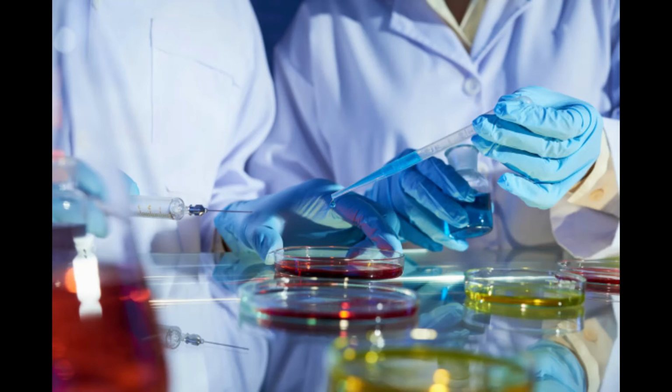That was the needle. That slant tube, do we use the loop? The loop on the slant tube. How to do all of that is written in your lab manual, or typed up in your lab manual. So, for example, on page 35, there's procedural diagram 1.16, a broth to a broth. And it has step-by-step instructions on how to transfer from a broth to a broth.